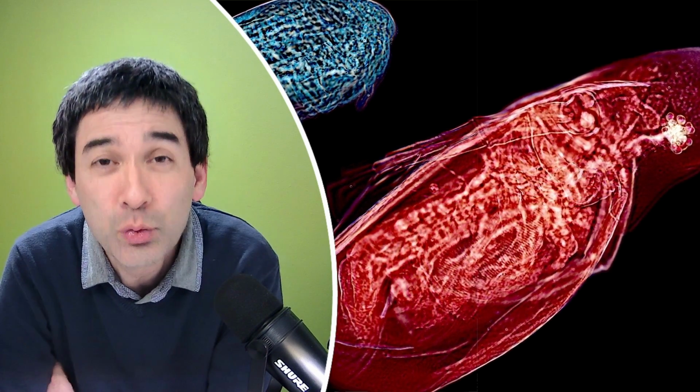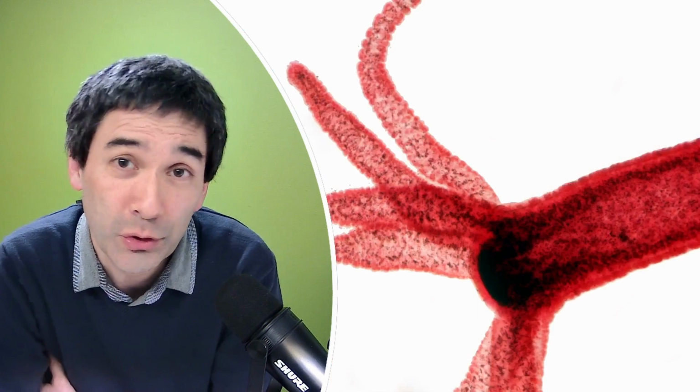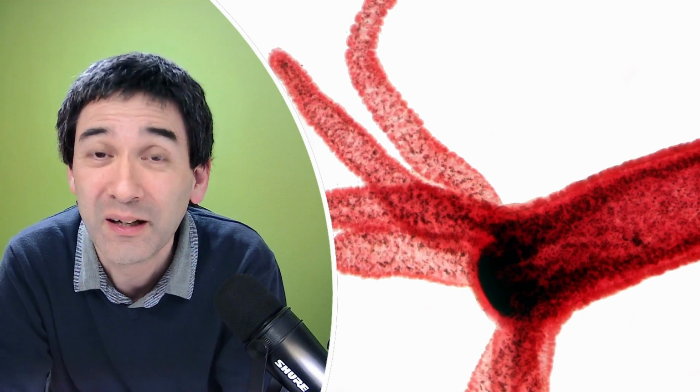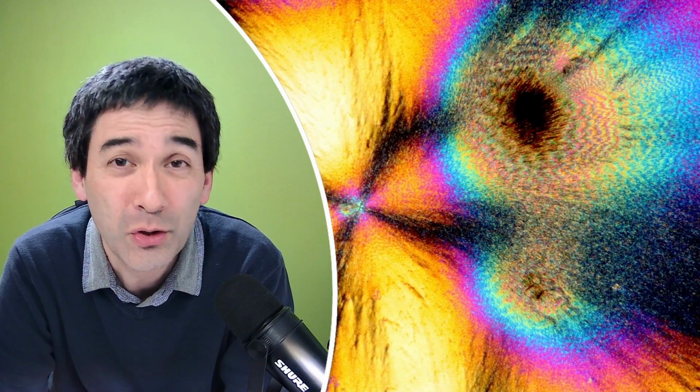I then add a little bit of dishwashing powder to the cover glasses and the microscope slides with hot water, and I simply let it stand for some time, and then I generously rinse everything. So basically I allow the dishwashing powder to remove everything that's sticking to the microscope slide. And then there is really no need to rub the cover glasses or the slides between your fingers to remove any dirt, because this has been done by the dishwashing powder, right? And for this reason, I generally don't have to take the risk of injuring myself, because I avoided it right from the outset.